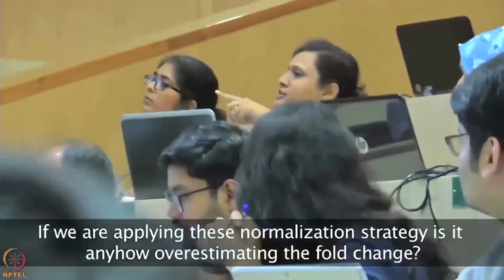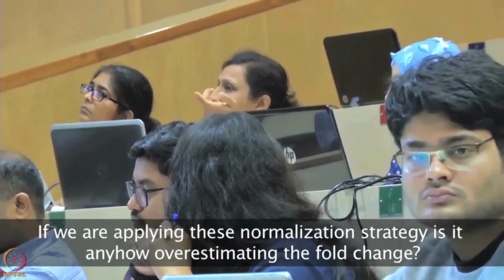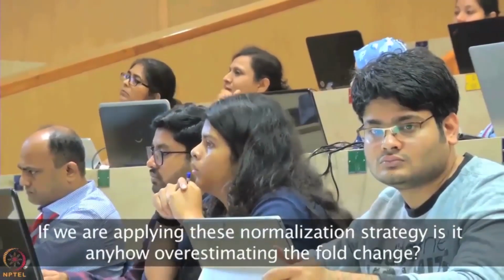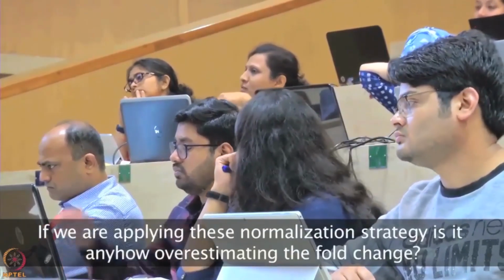Here, are we not overestimating the fold change compared to the unchanged proteins? Like in the earlier case, we were underestimating it; here we are overestimating it. The fold change values that we will get will be more than what they actually are.